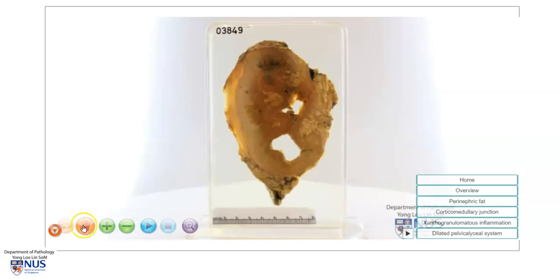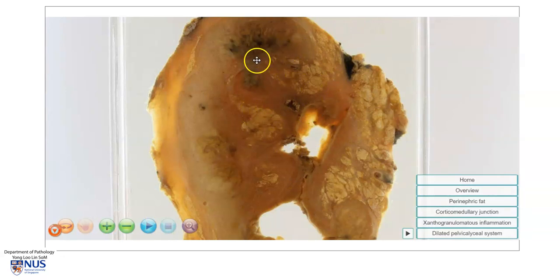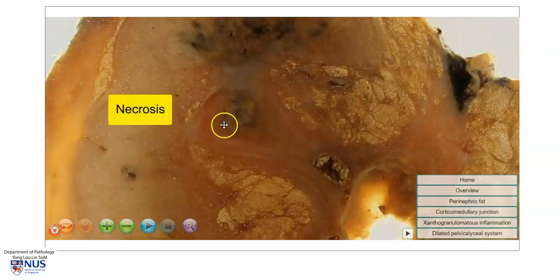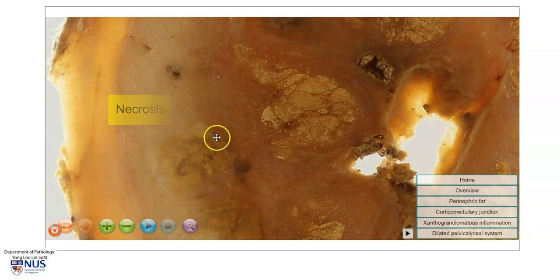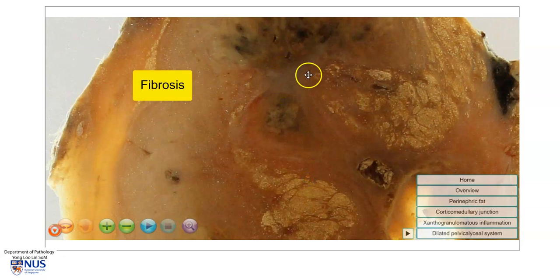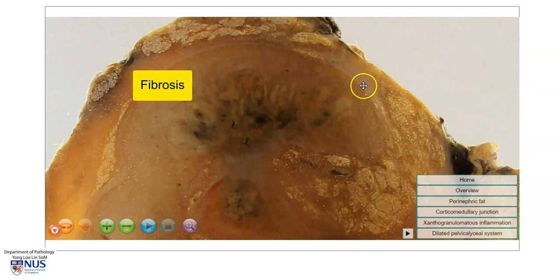We can see that there are many nodular areas of yellowish discoloration in the region of the renal medulla, and these are interspersed with areas of necrosis. We can also see whitish areas which represent fibrosis, and these whitish areas extend to the renal capsule and into the perinephric fat.